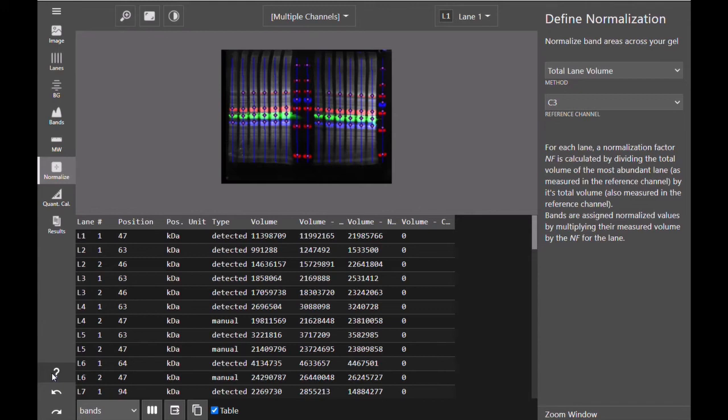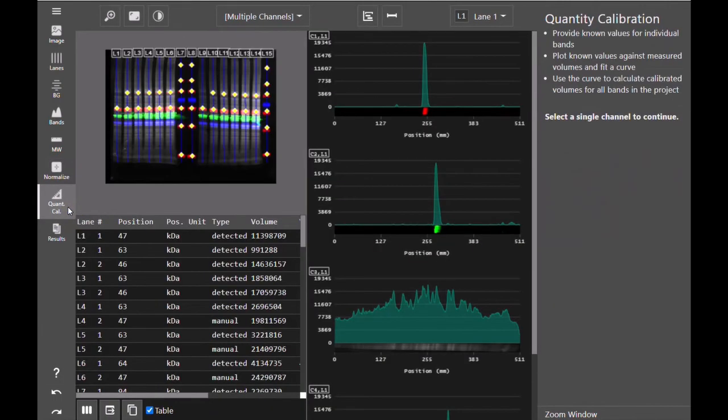So while normalization is a technique used to correct for loading errors or to account for the differences in protein load, quantity calibration is a technique used to determine the amount of protein in each band using a calibrated curve.